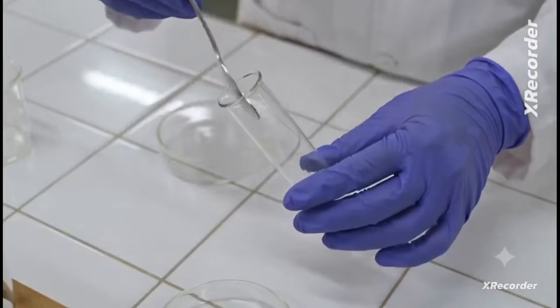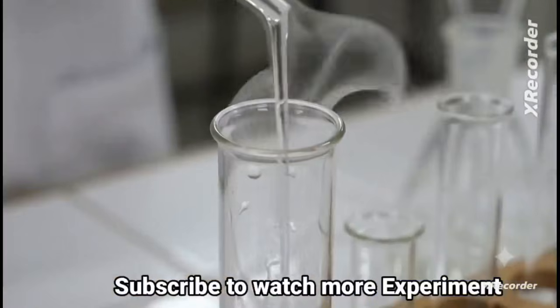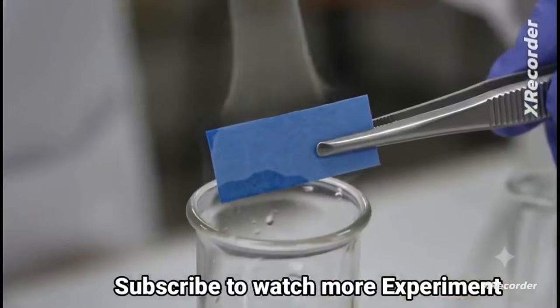Take about 1 gram of sodium chloride in a dry test tube. Add some concentrated sulfuric acid. Observe gas coming out. Test the gas with dry blue litmus paper. There is no color change.